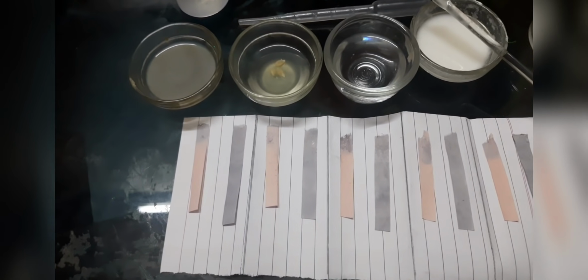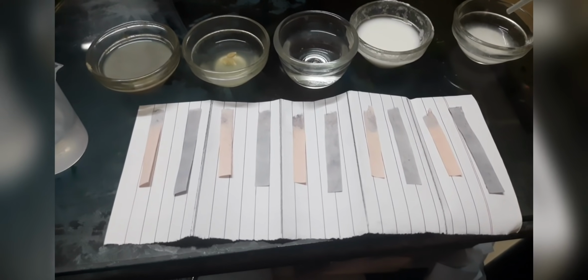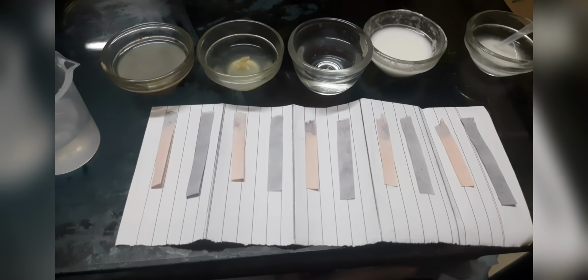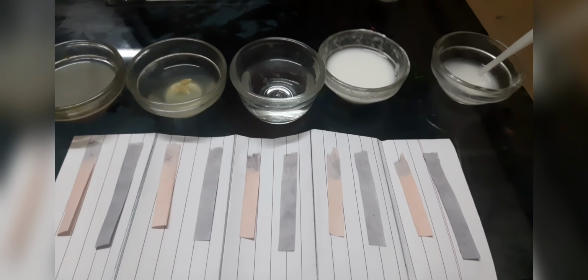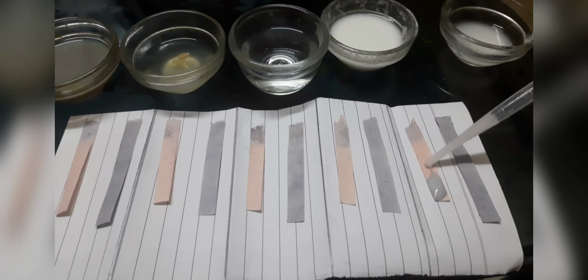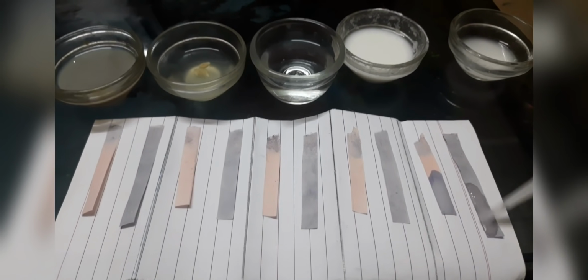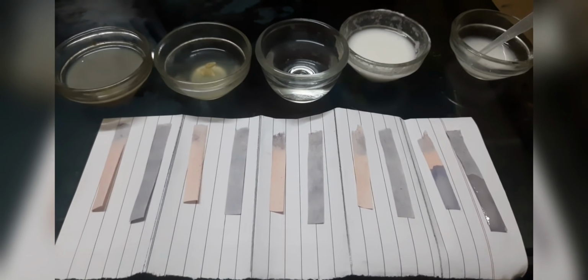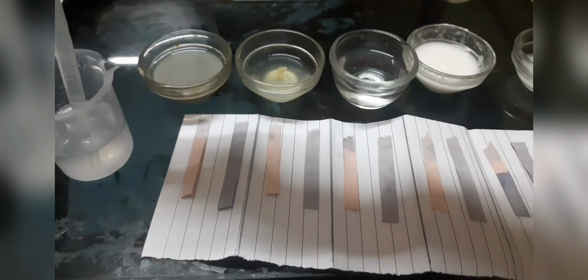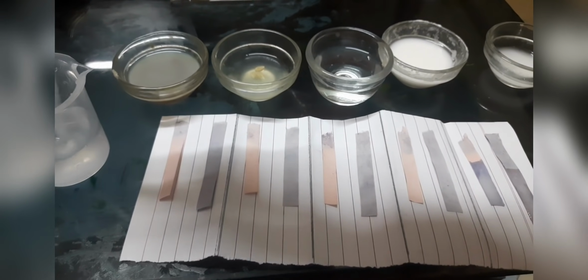Now let's test them all. We will start testing them with the help of this dropper. Let's start with the bleaching powder. This is a solution of bleaching powder. Take a bit. Put it on the red litmus. Put it on the blue litmus. You can see the result. Now wash the dropper. It's very necessary, because we will not get the right answer if we don't do this.